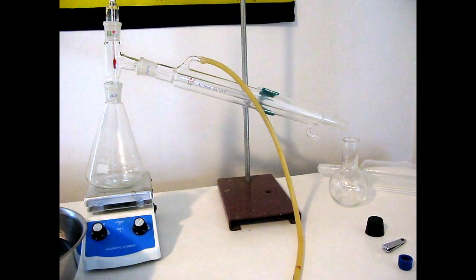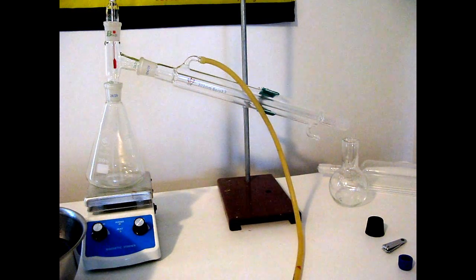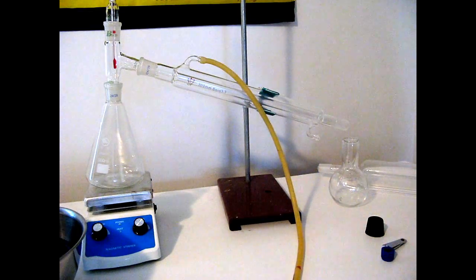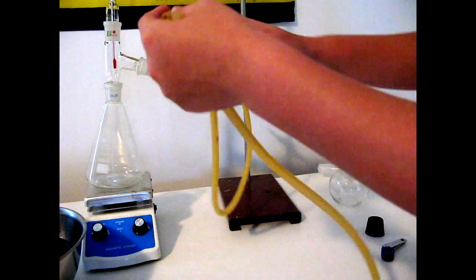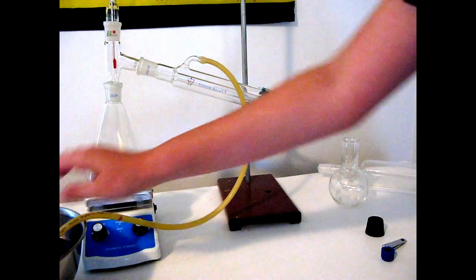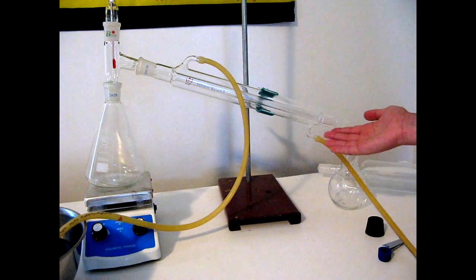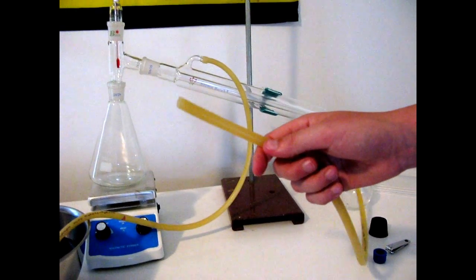Then you're going to want to set up some rubber tubing to have the water flow into your condenser. See, so first this top tube just will go into a bowl I have over there with a pump that I will show you later. Then this other tube you're going to want to set up.